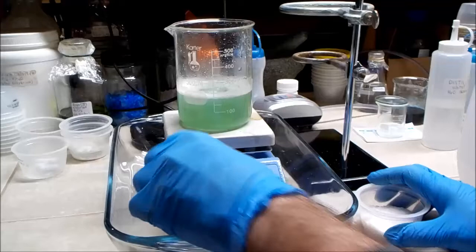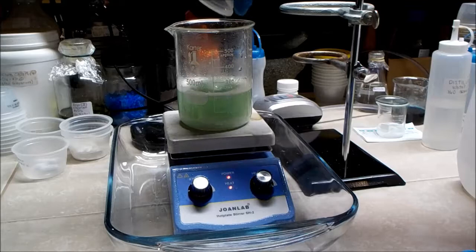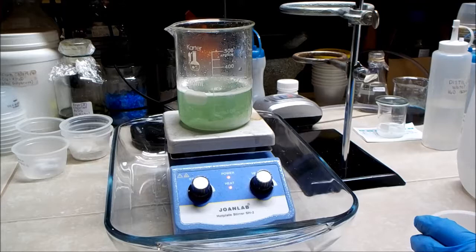And you won't really see any kind of reaction when you do this. It's just that when it crystallizes, they form a double compound in the crystalline structure. So once that has dissolved, I will go ahead and filter this all again, make sure everything's nice and clean. Then we'll let it crystallize.